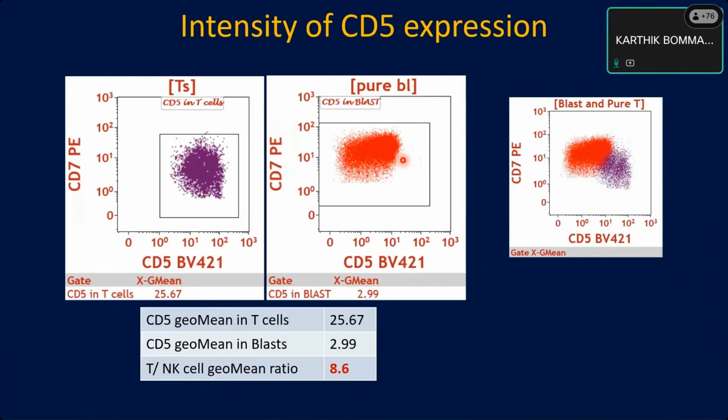So in this case, we have a T lineage oriented cell which is negative for CD1a, negative for CD8, having expression of CD34 and one myeloid antigen. Apart from that, CD5 is positive. So this becomes a near-ETP-ALL. Clear? So the difference between ETP-ALL and near-ETP-ALL is based on the CD5 expression.